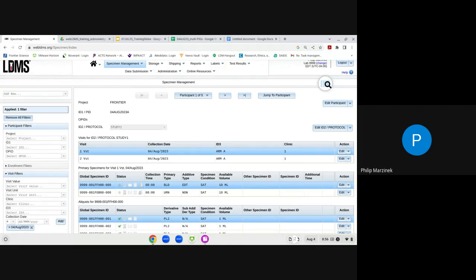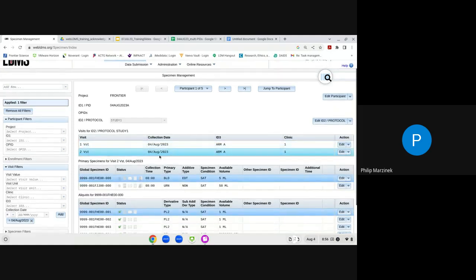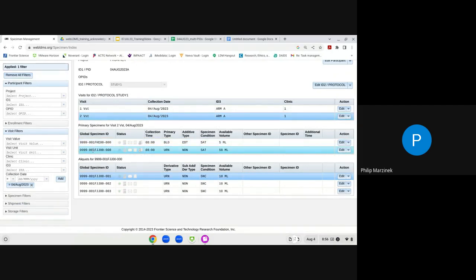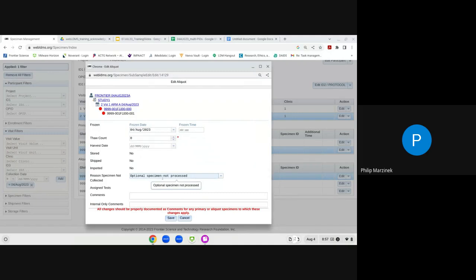Navigating to the first participant and Visit 2 — where the urine aliquots were not created — shows the status column indicating those specimens are not available. Those specimens are physically unavailable, but a record of the expected collection exists with condition code SNC listed on the aliquots. The reasoning is visible by clicking the edit button on any of these: the reason is defined as Optional Specimen Not Processed.